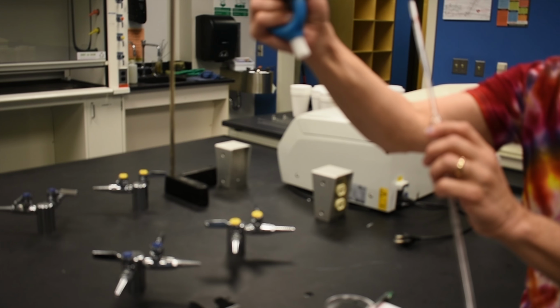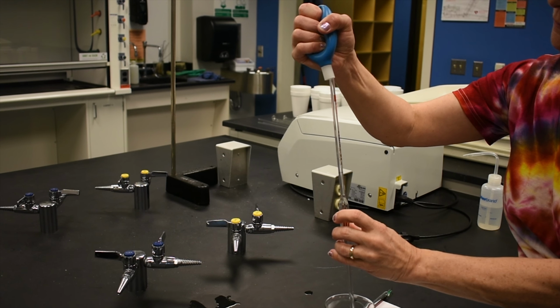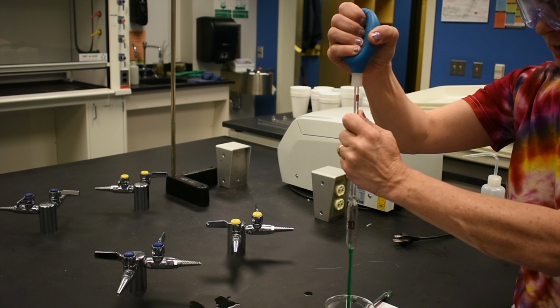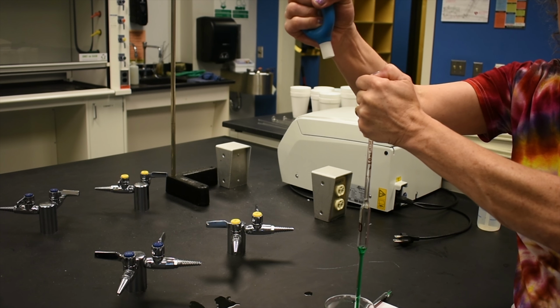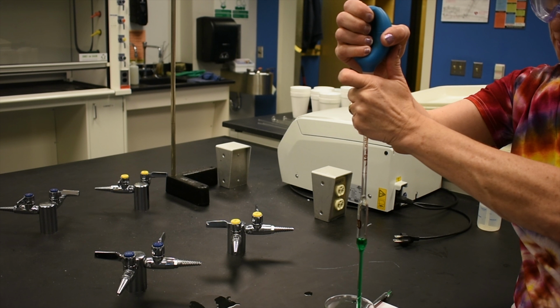So again, you squeeze out your pipette bulb, you place your pipette in your solution, place your pipette bulb on your pipette, and slowly release the bulb so the solution begins to draw up into the pipette. Now you can see, again, we're not done. I'm going to cap the pipette off with my thumb, squeeze out the bulb again, continue to draw solution up into the pipette.